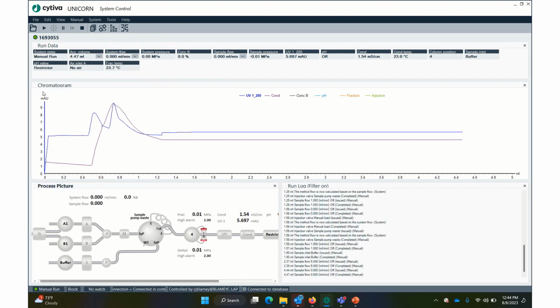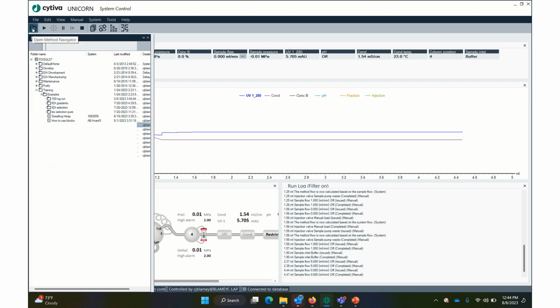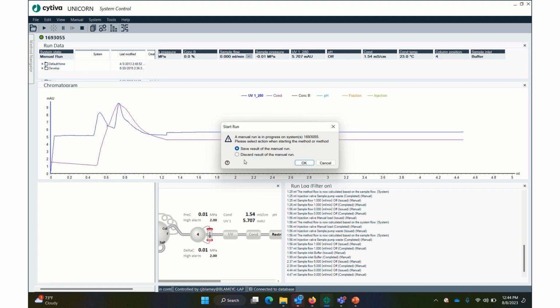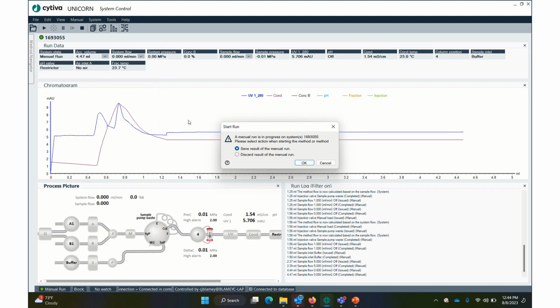All right, to start the method, we're going to go over here to the method navigator and click this. We're in the training folder. We're going to go down here to the method that we wrote last week, and we're just going to double click on it. You can right click if you want. This asks us if we want to save the manual run that we were just doing while we were attaching the columns and setting up the sample. I'm just going to hit discard.